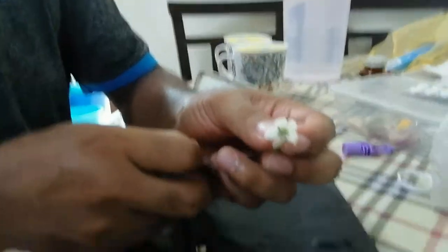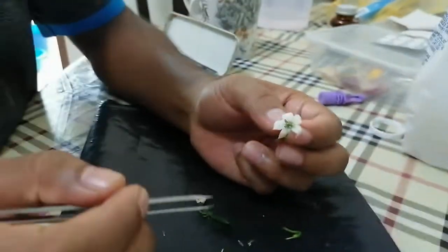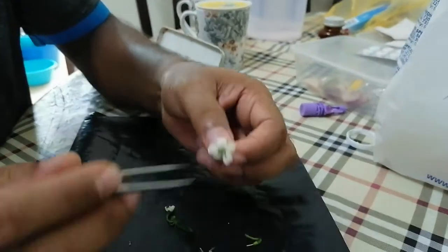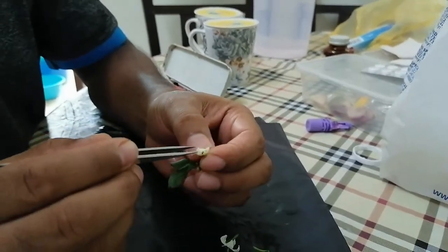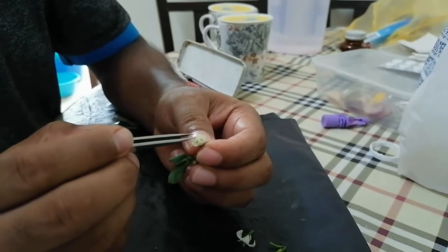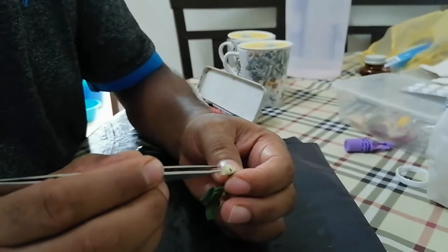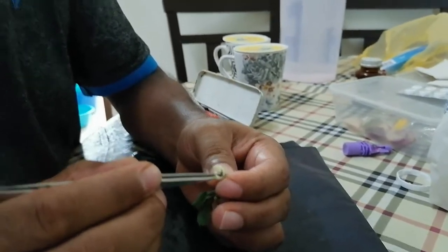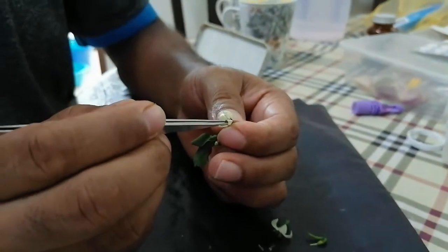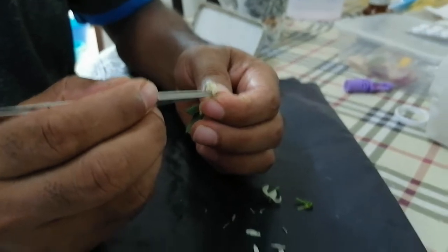They are bisexual and self-pollinated. If you want to do hybridization, before the flower opens, you have to open it manually and remove all the anthers one by one. This is called emasculation. When plucking the anthers, you have to be careful not to hurt the stigma.